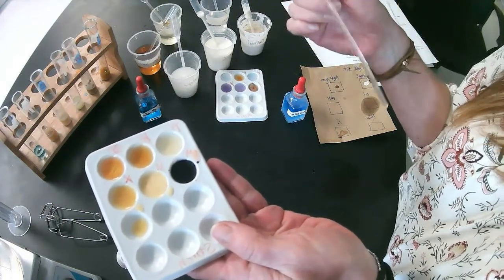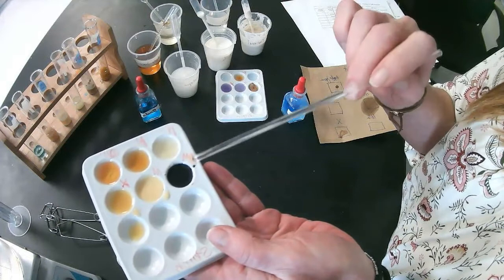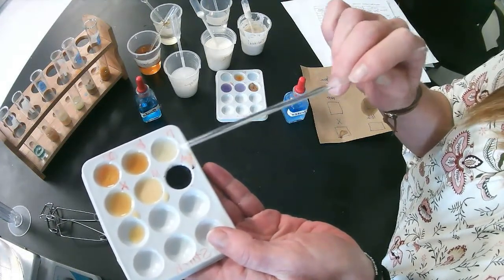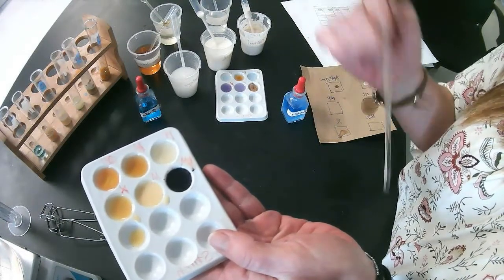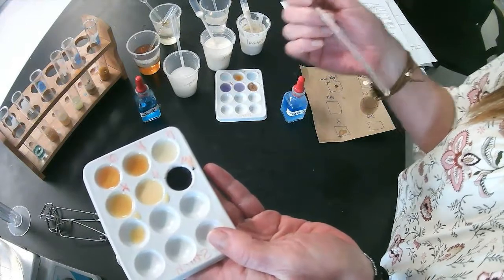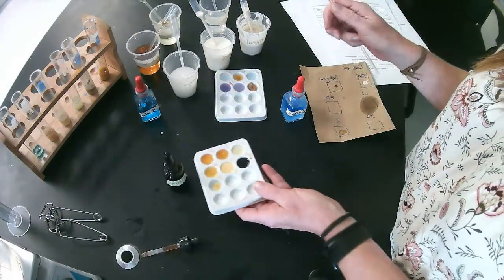So which one of those is positive? Yeah, that one's looking pretty black. That is the oatmeal. So oatmeal is the only one of our substances that is high in starch, which is, again, a carbohydrate. Okay. I think that's all of the tests, right?